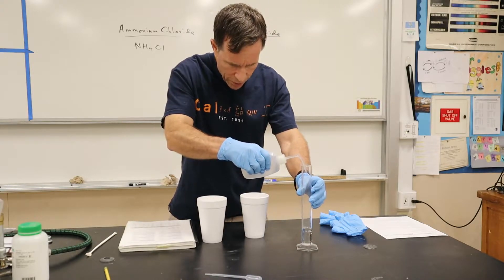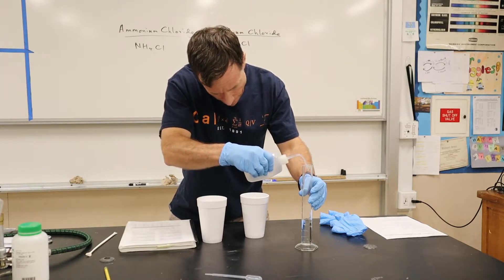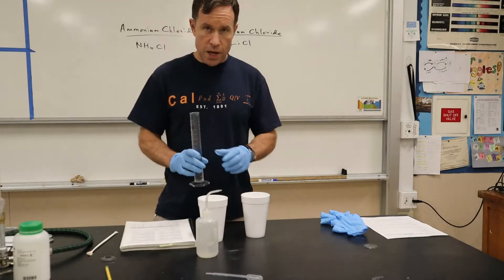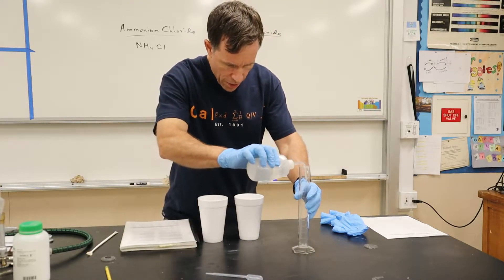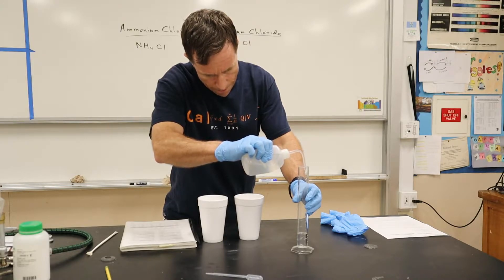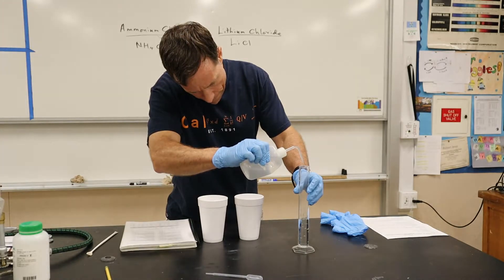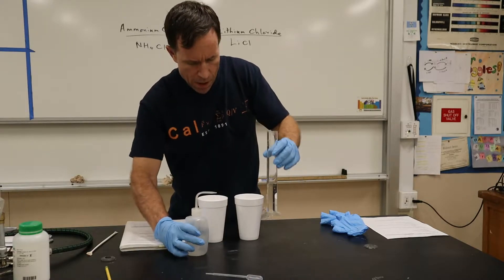This works really well because I can control how much water is going in there. It doesn't have to be exact — okay, that's pretty close, maybe a little bit more. Now I'm going to take the water and pour it into one of the cups, then fill the other cup with 45 milliliters as well.